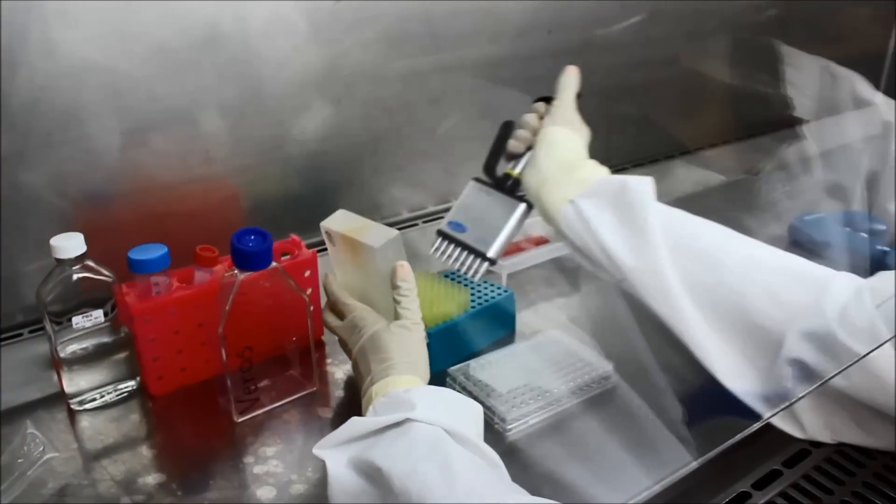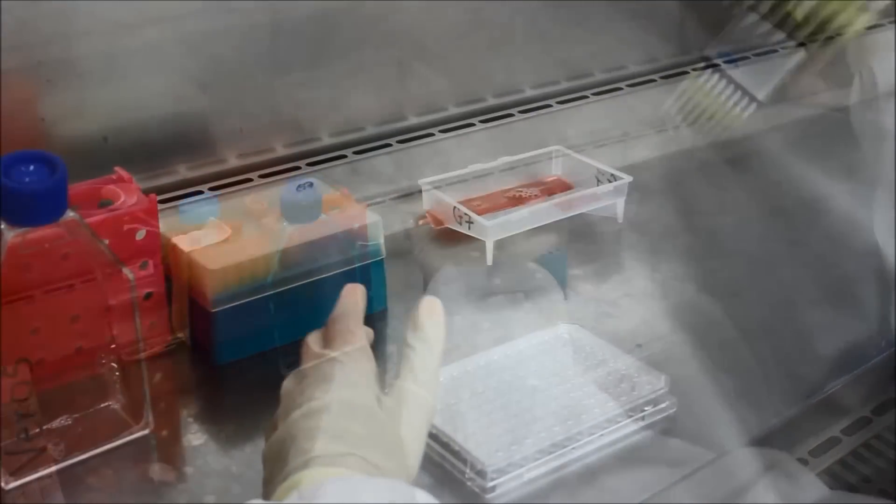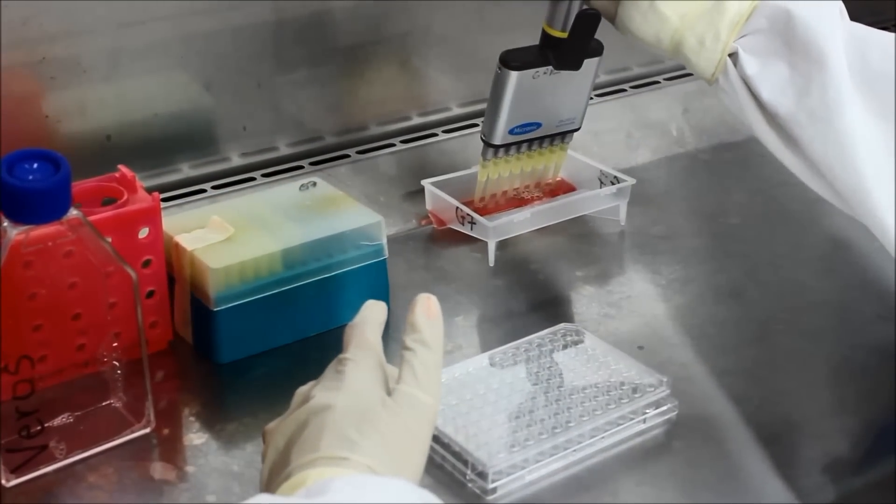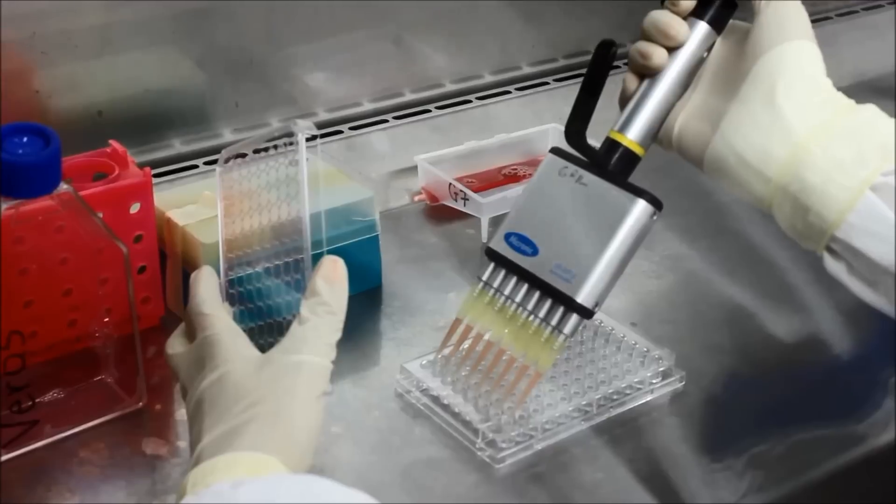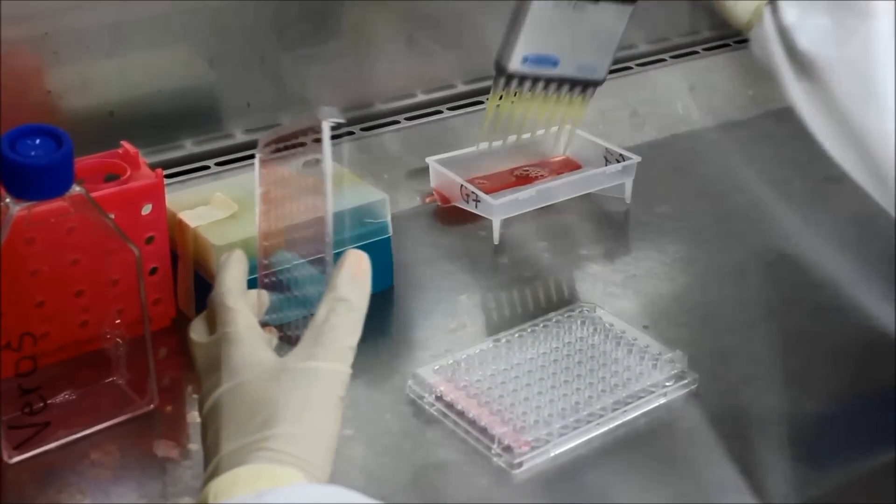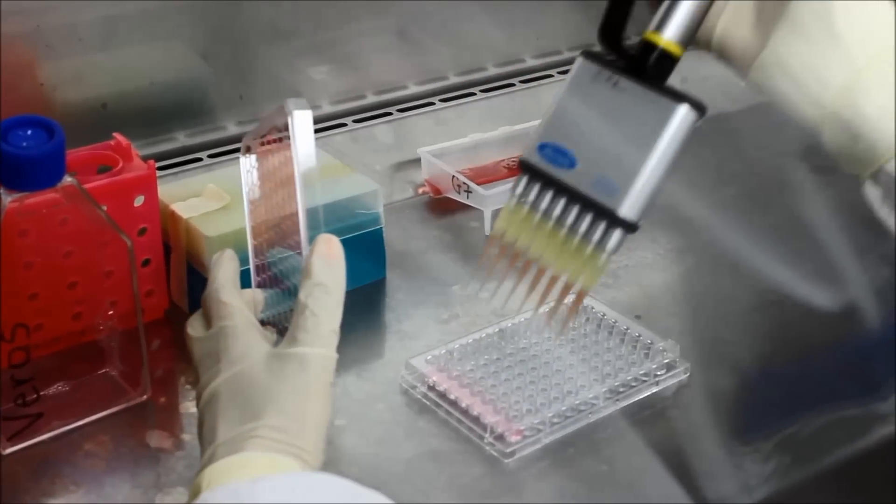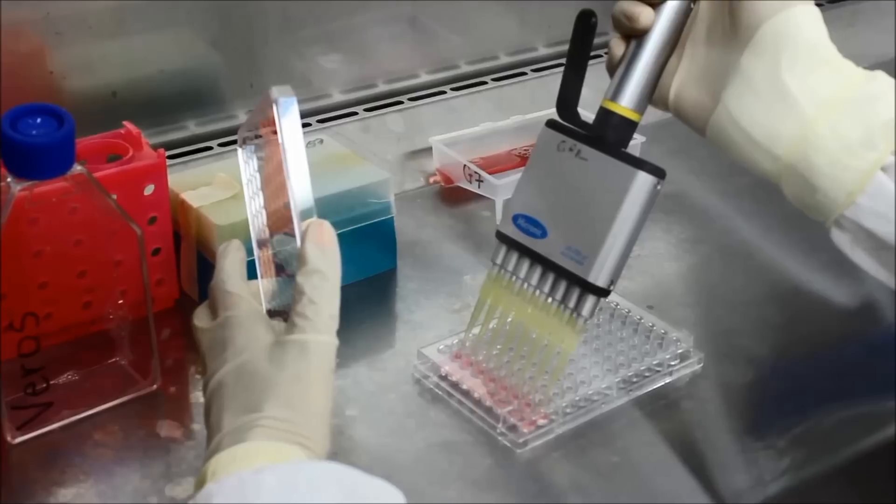Set your multi-channel to 100 µL and add cells to your tray column by column. Make sure to pipette up and down to keep breaking up cell clumps when necessary. You do not need to change tips between columns.